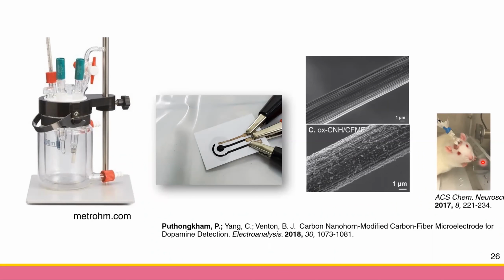For example, they may let the rat take some drug, like maybe cocaine, or maybe they let it eat something delicious, and they detect the neurotransmitter compound. And these neurotransmitters are electroactive, like maybe dopamine, maybe serotonin. These species can be oxidized, so you can measure the current and then maybe explain the correlation between these neurotransmitters and the behavior of the animals.